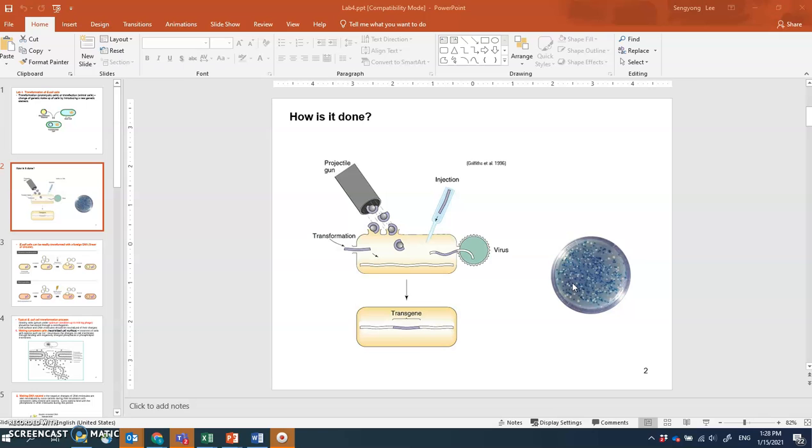If the enzyme is still made, the gene of interest is not inserted. But if the gene that codes for the enzyme is disrupted by the gene of interest being added, the mutation happens, so the enzyme is not made anymore. So the color of the colonies will stay white instead of blue. So actually, among these cells, the white ones are the ones you need. We can talk about that later again.